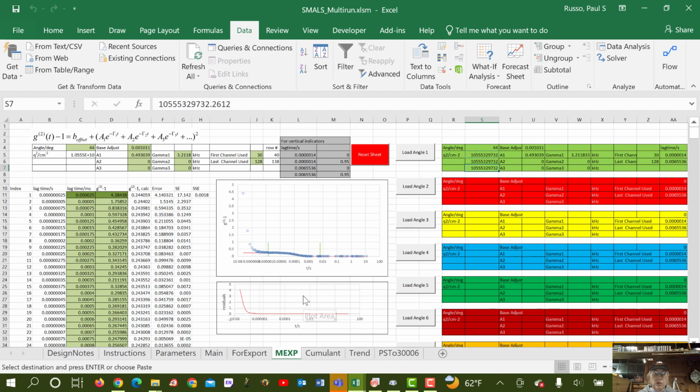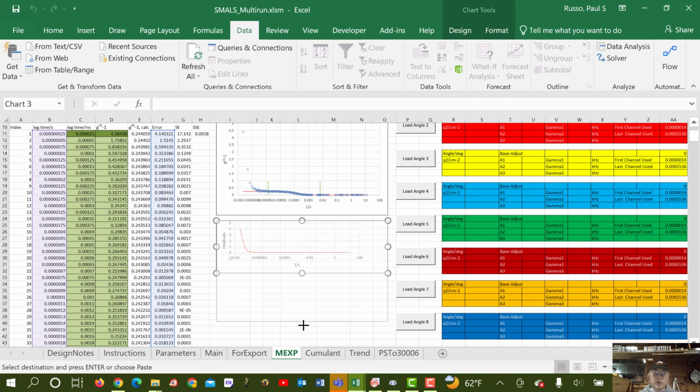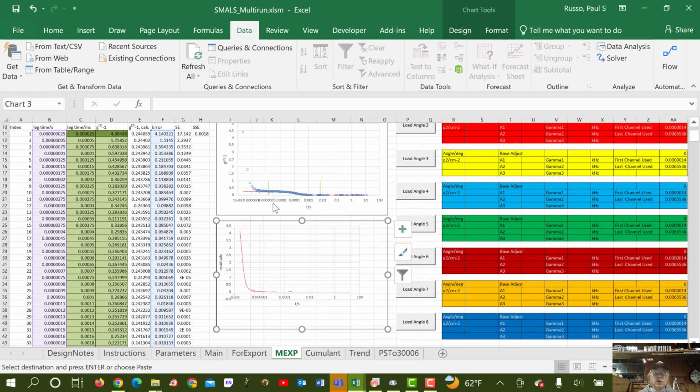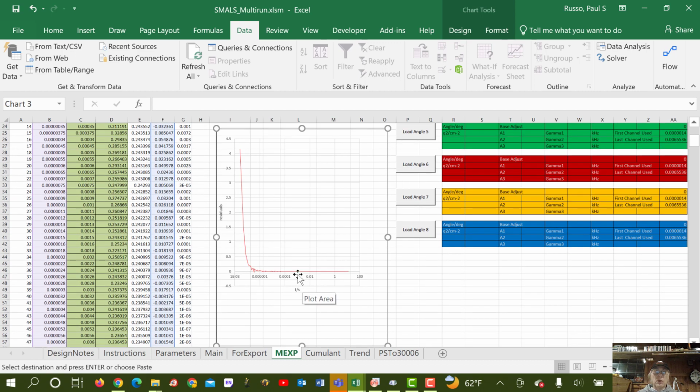You can always in these programs look at your residual plots and expand them up a little bit. And you here see that we have a rapid decay here, which is some combination of correlated afterpulsing and I think a little bit of a rapid decay cooperative diffusion mode or something very small building into this solution. But anyway, I guess we really have to expand this to see whether these are working.